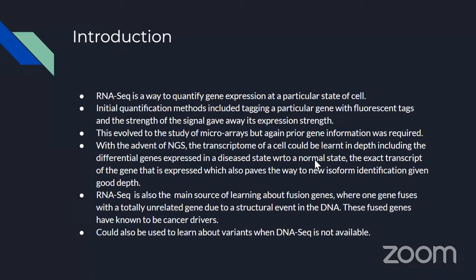So, what is RNA-seq? This is a technique or method in which you can quantify a gene's expression at a particular state of the cell. For example, you can quantify gene expression in a tumor cell with respect to a normal cell.